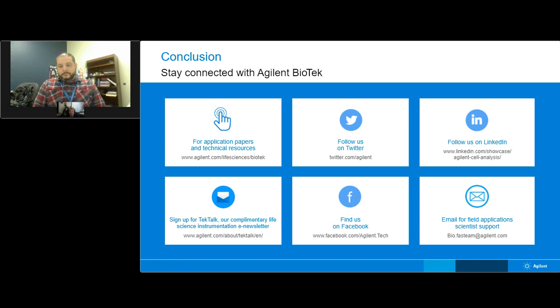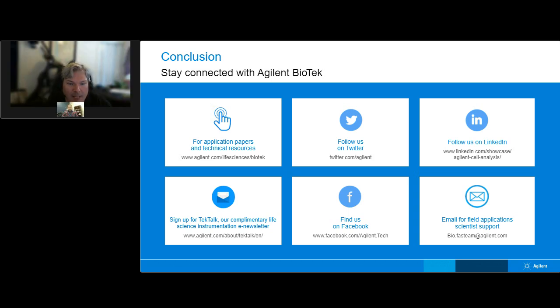Gotcha. That makes sense. All right, a few more coming in. Can I still image with other objectives when the water immersion objective is in place? Yeah, so nothing's really changed.